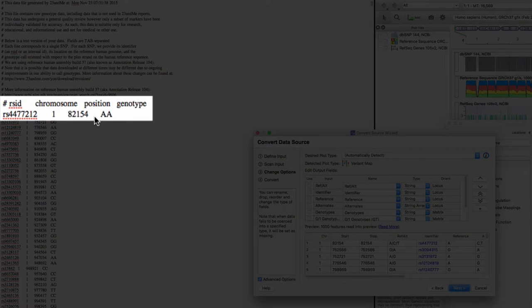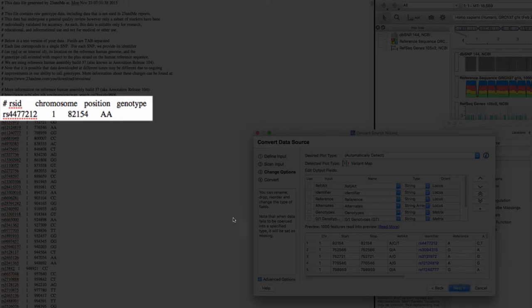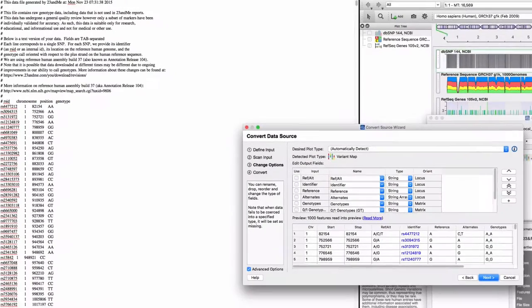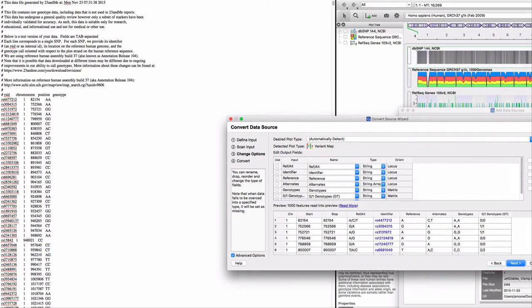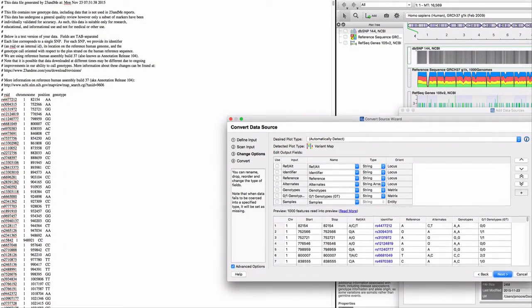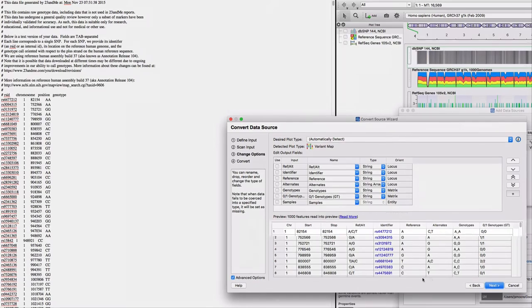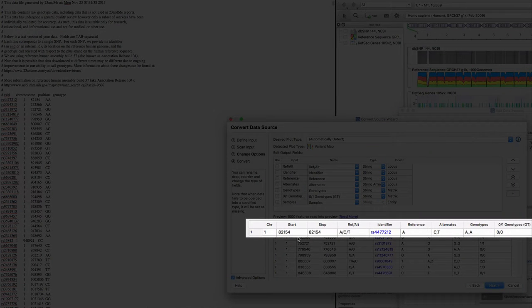The first line is SNP RS4477212 at position 82154 of chromosome 1 with genotype AA. Now inspect the preview of converted data. The first line is in perfect agreement with the raw data.